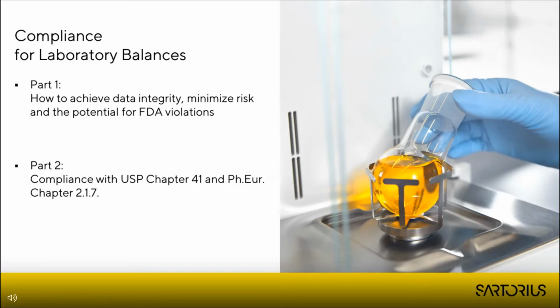The second part of the presentation highlights important news for the pharmaceutical industries. The new chapter 2.1.7 of the European Pharmacopeia is compared with the USP Chapter 41. The differences are highlighted and software solutions discussed to ensure compliance. We will now start with the part of data integrity.